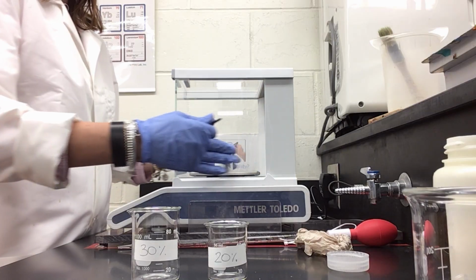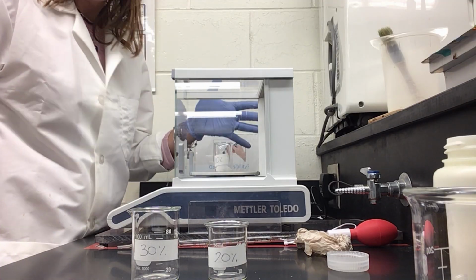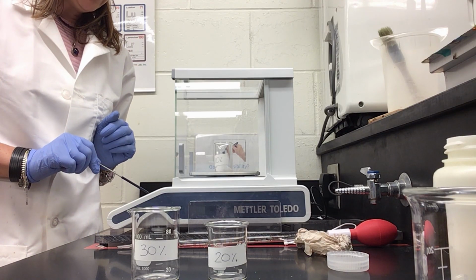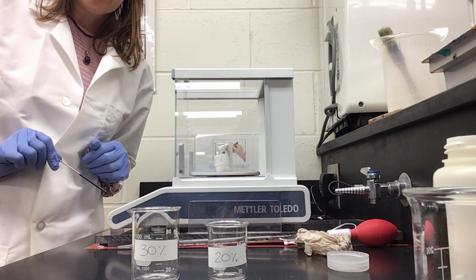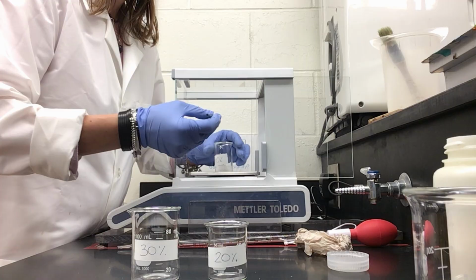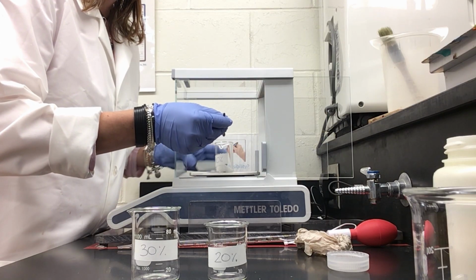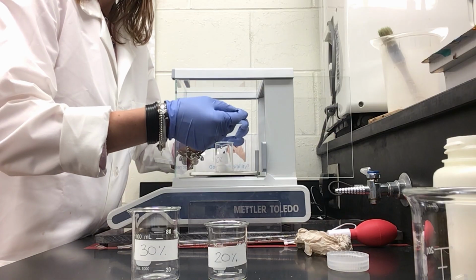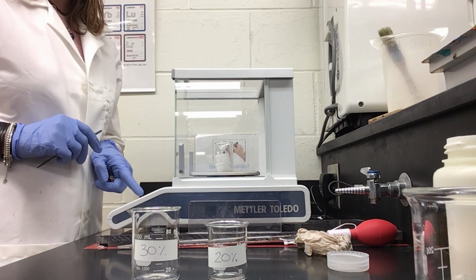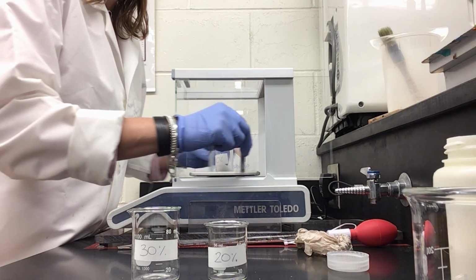Let's see. Now I close so that air doesn't go inside and doesn't mess with the real weight of my sample. And I measure. Now this is 3.562 grams. Okay? So I need to take a little bit away. So I reopen. I do this, making sure that I don't put the spatula over the balance. I approach the weigh boat and I put it away. I close and I see how much it changed. It's not quite 3.5, it's 3.533, so I need to take some more away.